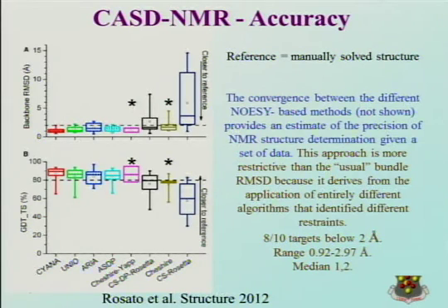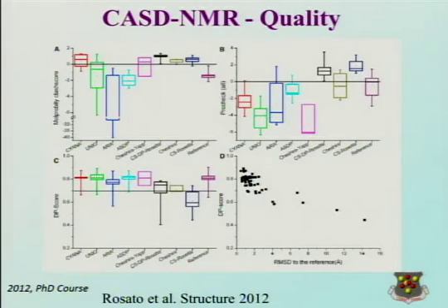So this tells you that for the current state of the art, you have to use NOE data. You have to use these upper distance limits. And if you use them and they are of sufficient quality, you can actually do pretty good in terms of doing things automatically rather than manually. Then you go to check quality, and we check out the scores that I was mentioning now.